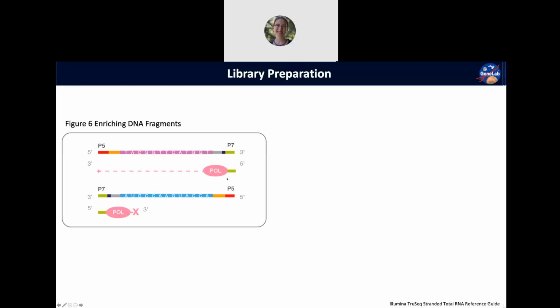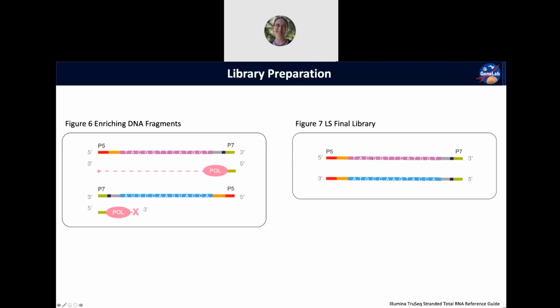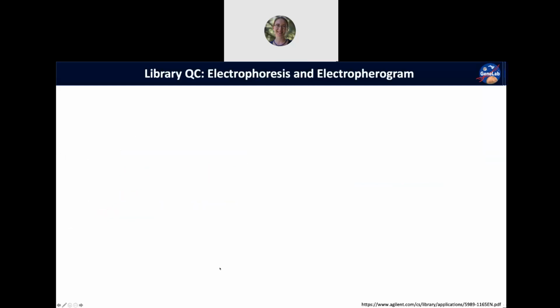And so then coming off of this step, we do another filtering step to get rid of the polymerase, to get rid of the free nucleotides that are there. And then we also remove the template here with the U's. And so we're just left with stranded libraries. And so those stranded libraries contain T's, and then that's what's ultimately put on the sequencer and sequenced. Make sense? Makes more sense. Great. Okay.